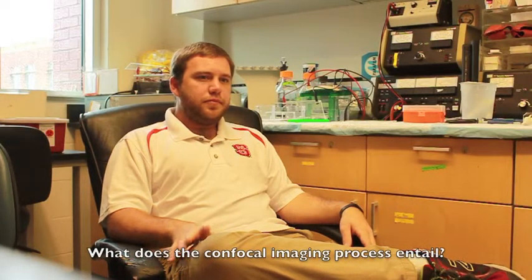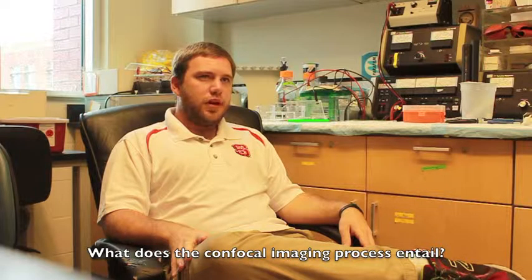What does the imaging process entail? It depends on your scope. There are multiple types of sensors and cameras and stuff like that. There is your basic camera, which is very similar to one of these guys, and some of your fluorescence microscopy will actually use a DSLR like that.